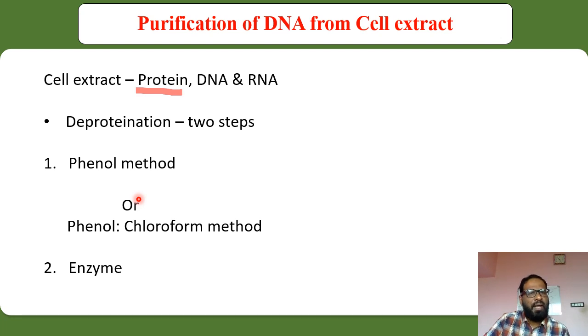As a consequence, every treatment with phenol chloroform is followed by centrifugation. If you centrifuge the DNA repeatedly, the DNA molecule is going to be broken into pieces. That's why we have to go for the enzyme treatment first. It will convert the larger proteins into small peptides.